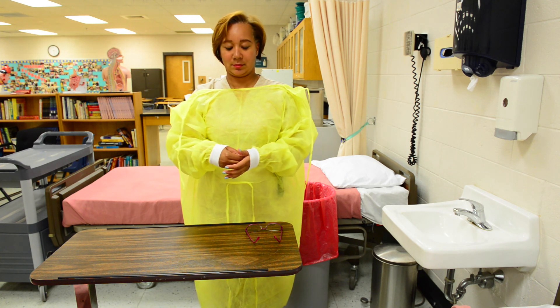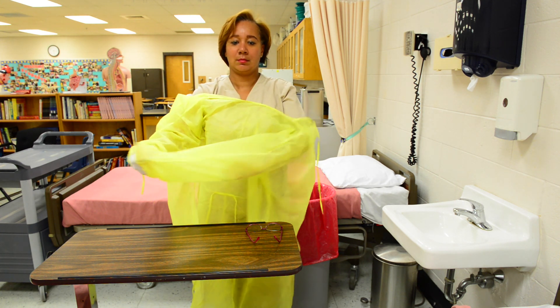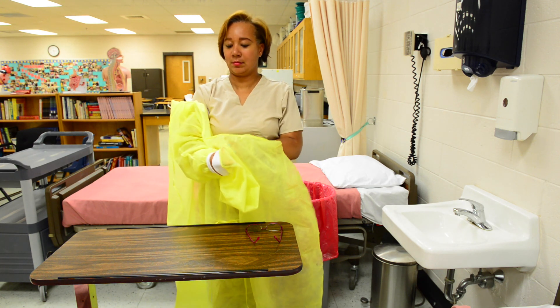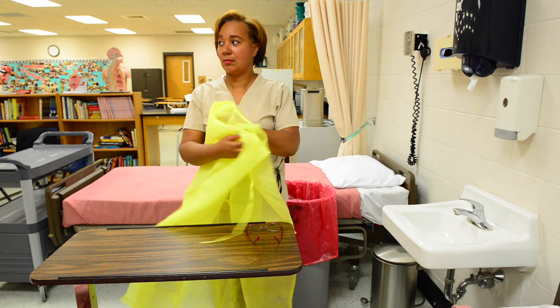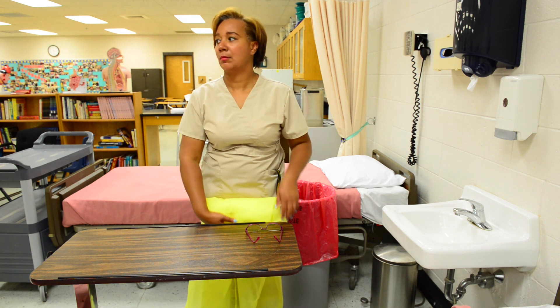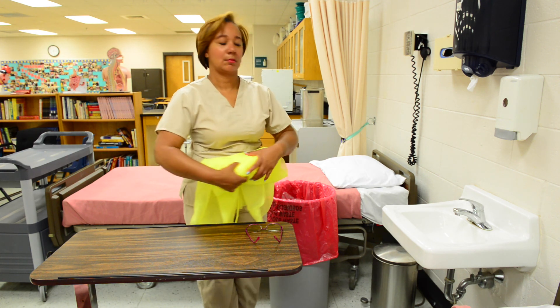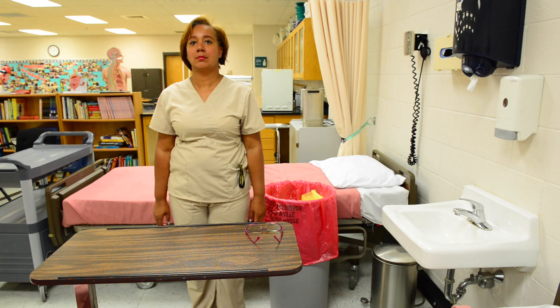Place one hand inside cuff and pull sleeve over hand. Place covered hand on outside of gown to pull gown sleeve over second hand. Ease out of the gown gently and fold gown to make inside of gown on the outside. Roll the gown and place in infectious waste container. This concludes our video on PPE.